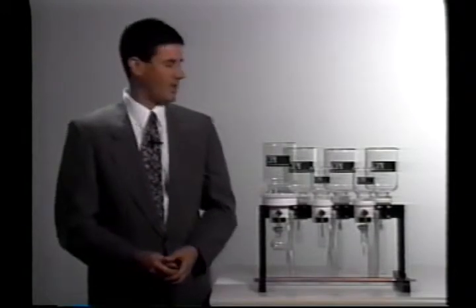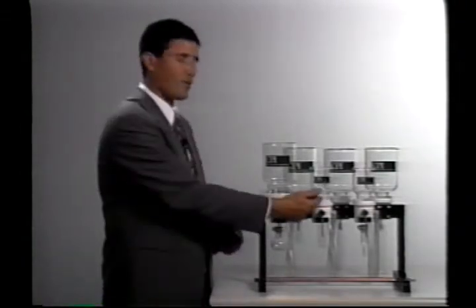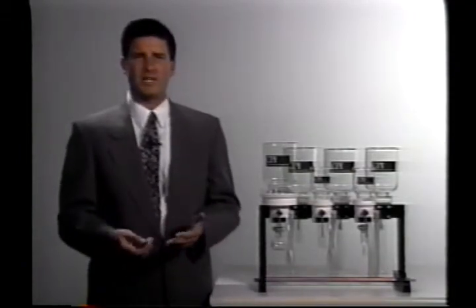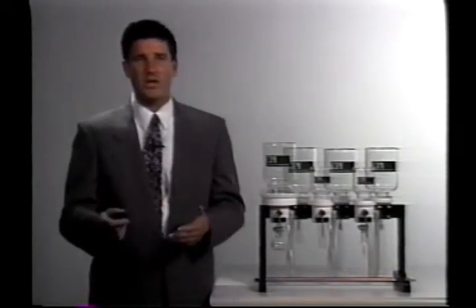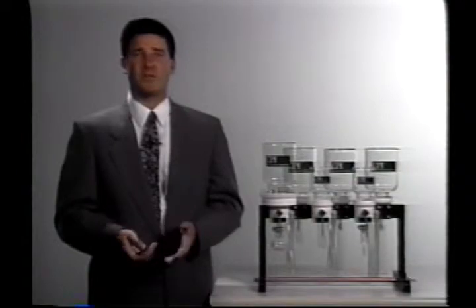We also give you the option of selecting the size of each extraction station. This manifold has a ninety millimeter setup as well as forty seven millimeter stations. It's also very easy to convert from the forty seven millimeter to the ninety, and I'll show you that in great detail in just a little bit. This once again gives you flexibility — you don't have to dedicate a position to nineties only. You can work with both and switch back and forth, making it very compatible with several different extraction techniques and several different EPA methods.